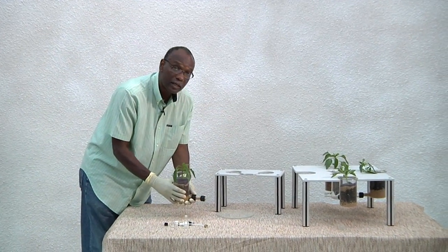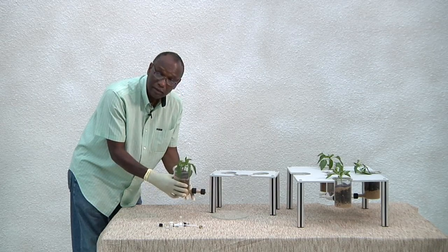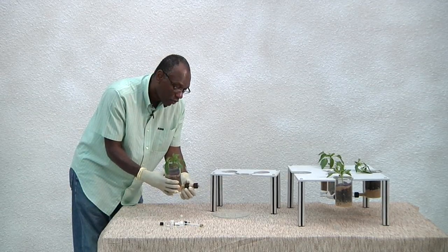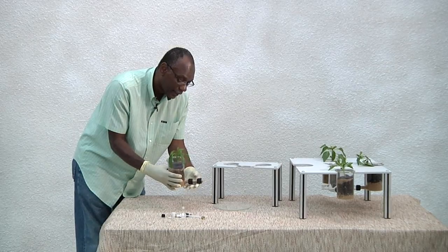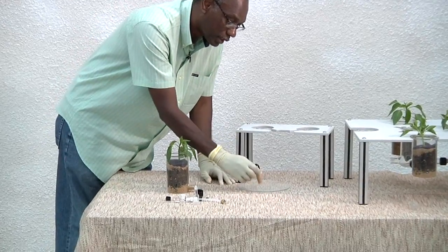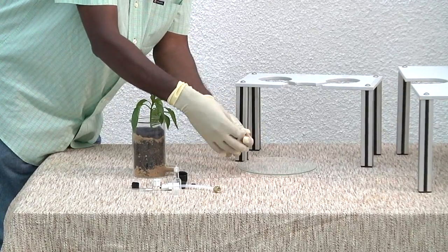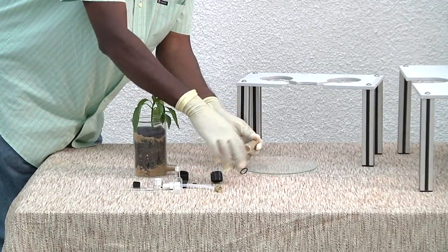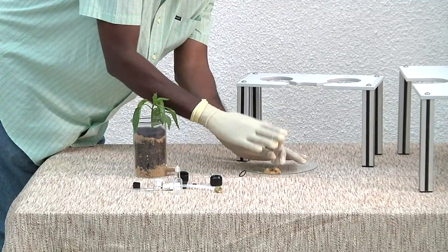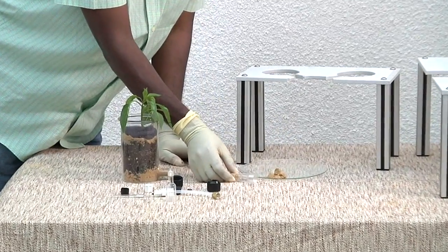Now when you're done with the bioassay, you remove the plant growth chamber from the soil olfactometer, and also remove the nematode collection chamber. Empty the soil into a tray, make sure that it is moist, and then under the microscope you can count the number of responding nematodes.